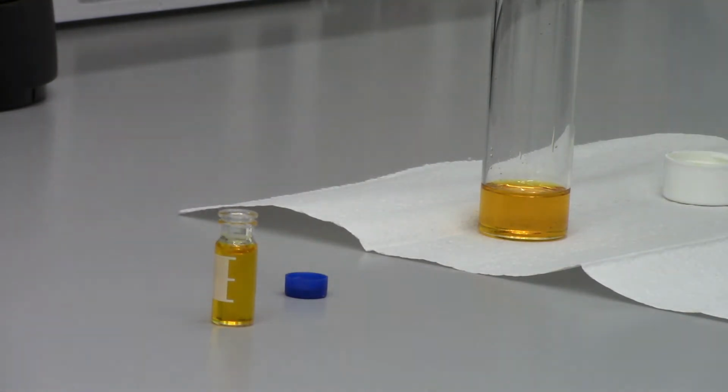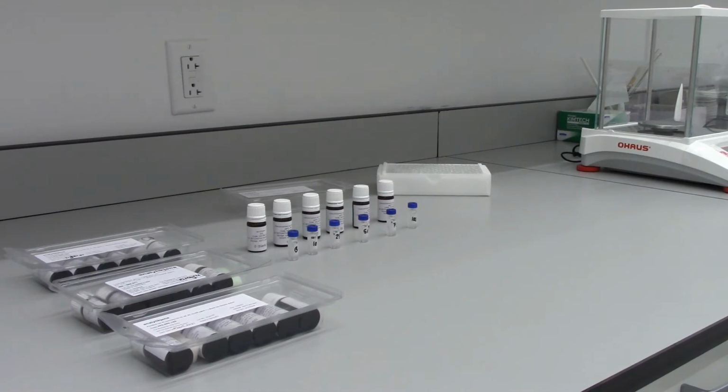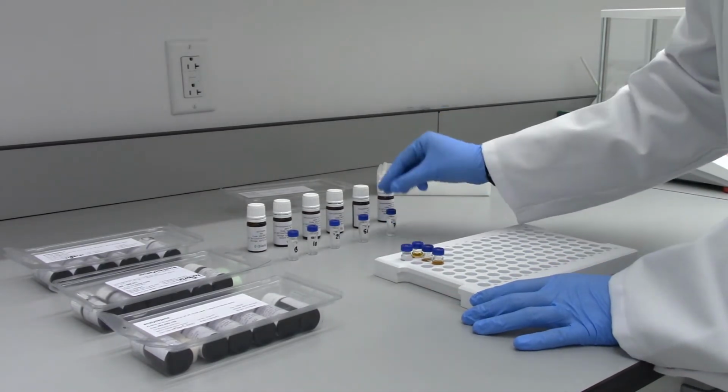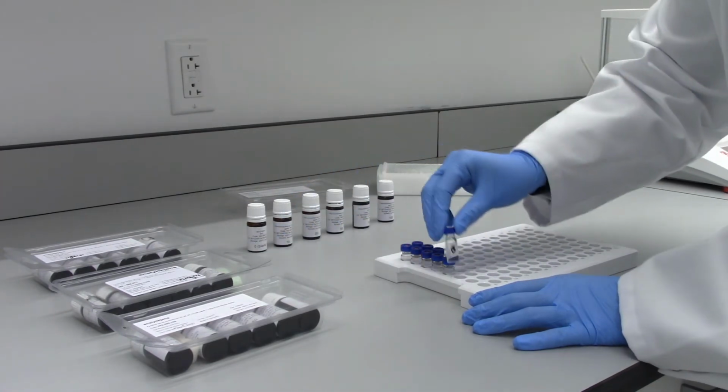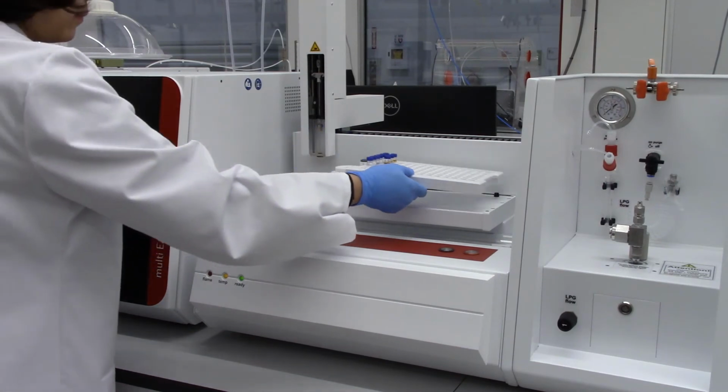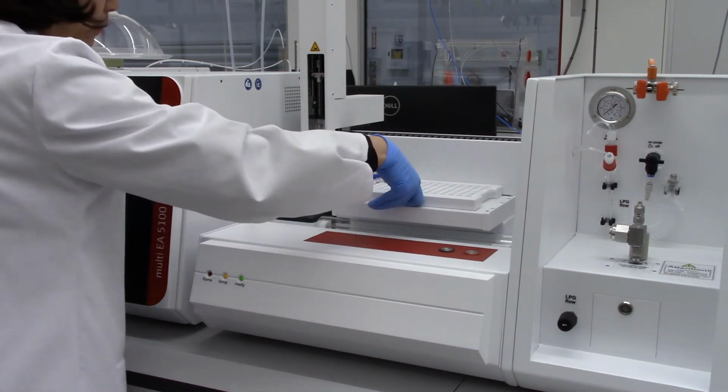Once we're done, all the standards and samples are inserted into the sample tray, which we will then place on the multi-matrix sampler. And once we've entered the sample IDs and weights into the software, we are ready to analyze.